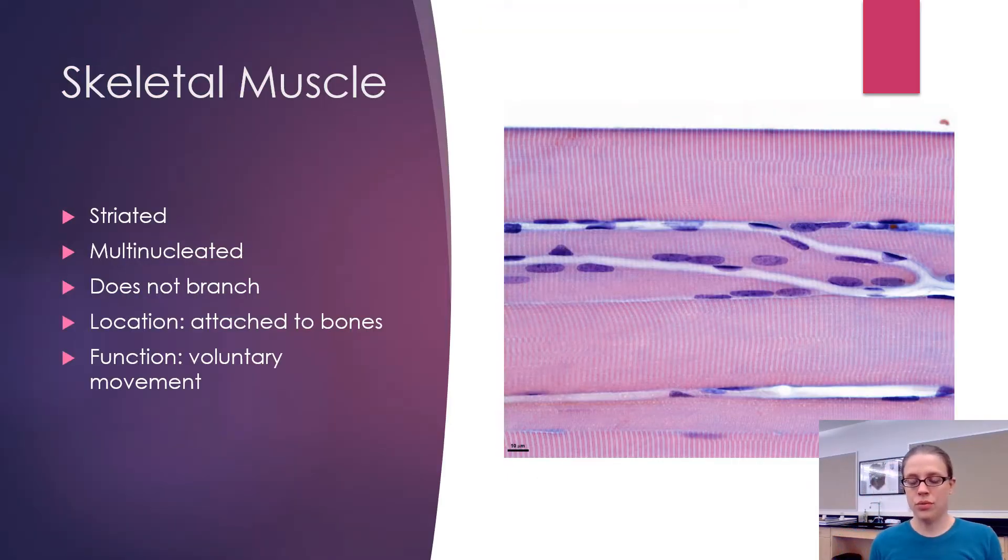Moving on to muscle tissue. This is skeletal muscle. You can tell because it's striated. Striated just means that it has these light and dark bands of color. Also it's multinucleated. The nuclei are all of these purple guys that are out along the edges. Skeletal muscle has a lot of nuclei. As most of you probably know, you find skeletal muscle attached to bones. The function of skeletal muscle is to allow for voluntary movement.